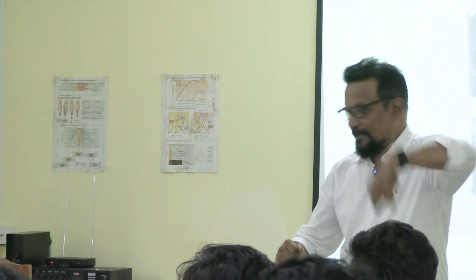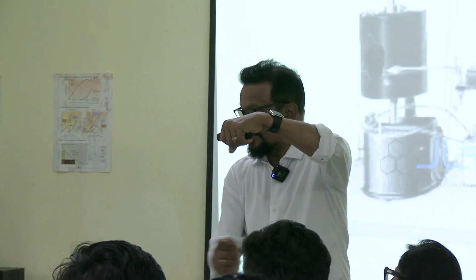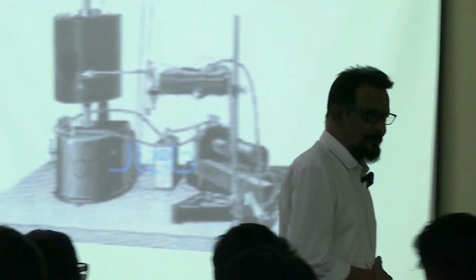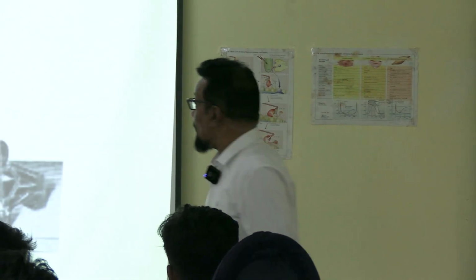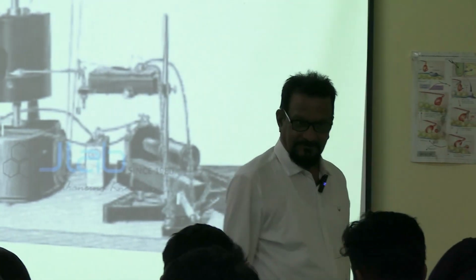Then start moving it, keeping the lamp at the bottom, from this end to that end. After some time, the surface will be blackened. This process is called smoking of the drum. Now you move the drum onto the kymograph.